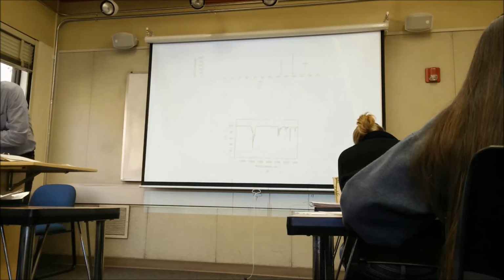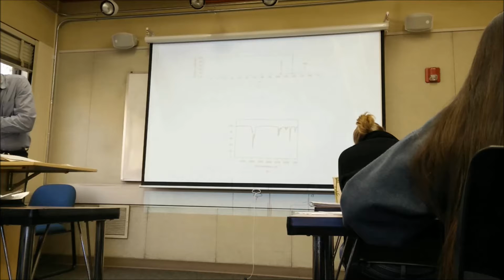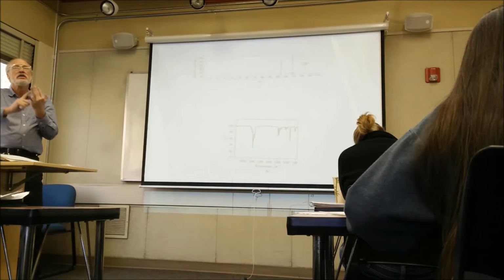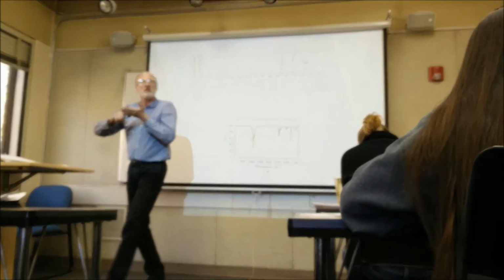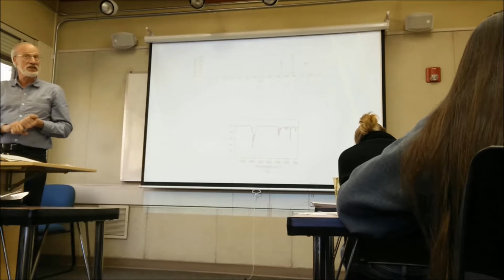Okay, look at the mass spec. Do you see any indication that there are heteroatoms? There's no nitrogen. There's no iodine, there's no 127. There's no couplet of like a 92 and a 94, right? Bromine, there's no halogen. None of the indications of a heteroatom are in there. So if there's a heteroatom in there, it's an oxygen.